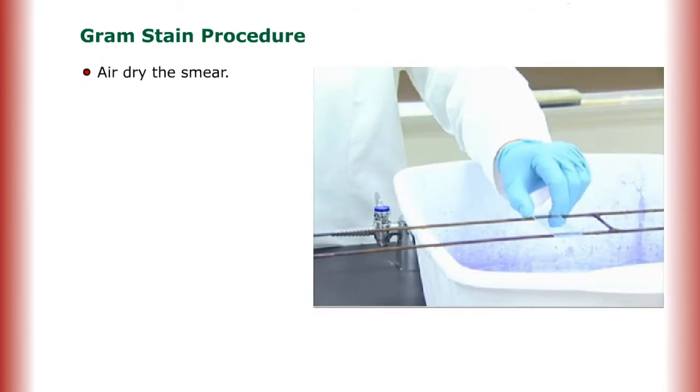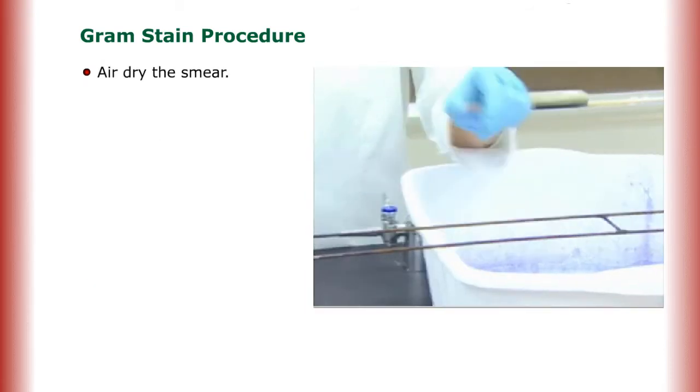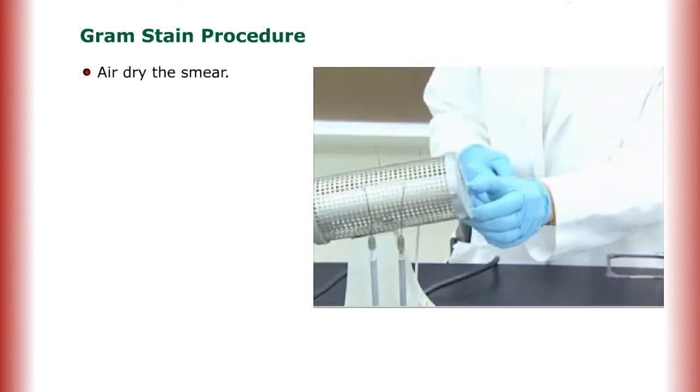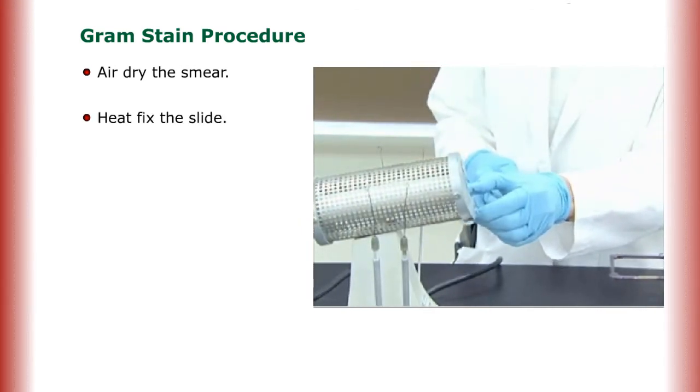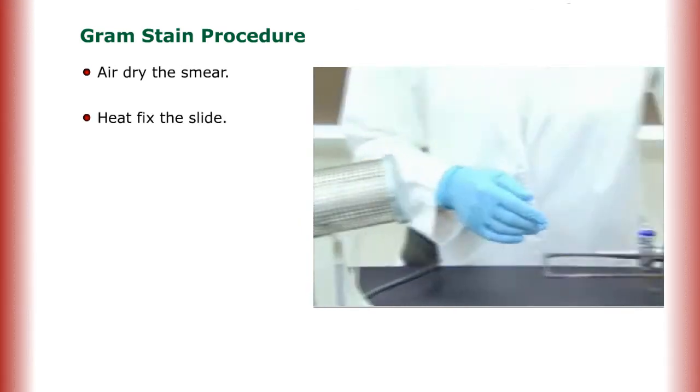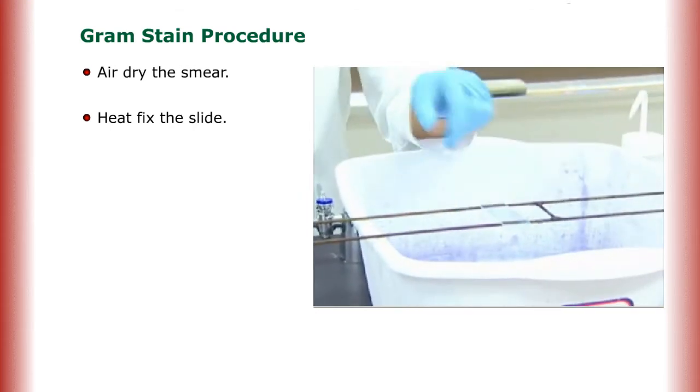The smear that I just made has air dried and now I will heat fix the slide by touching it briefly to the burner. And now I am ready to Gram Stain.